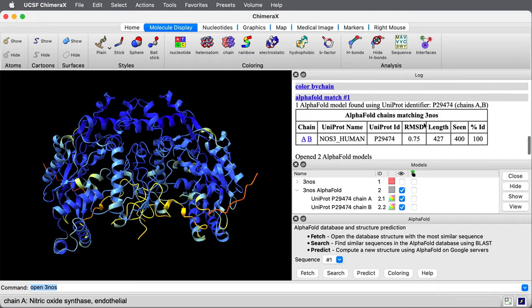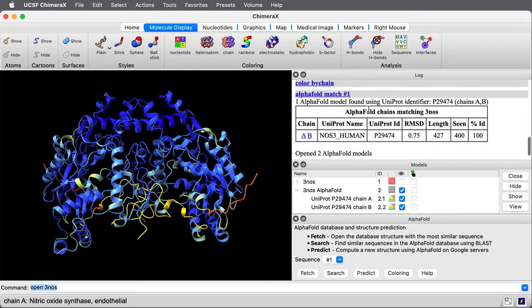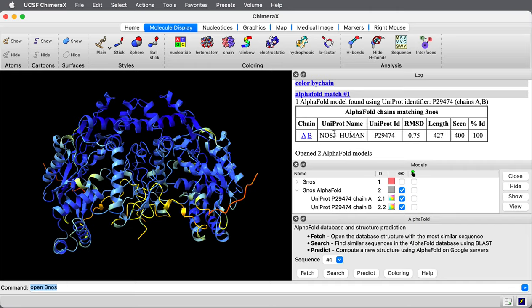If we look in the log, the Fetch created this panel, which tells us a little bit about the AlphaFold model. It says it came from this gene, NOS3 human. That's the nitric oxide synthase. That's the uniprot name.